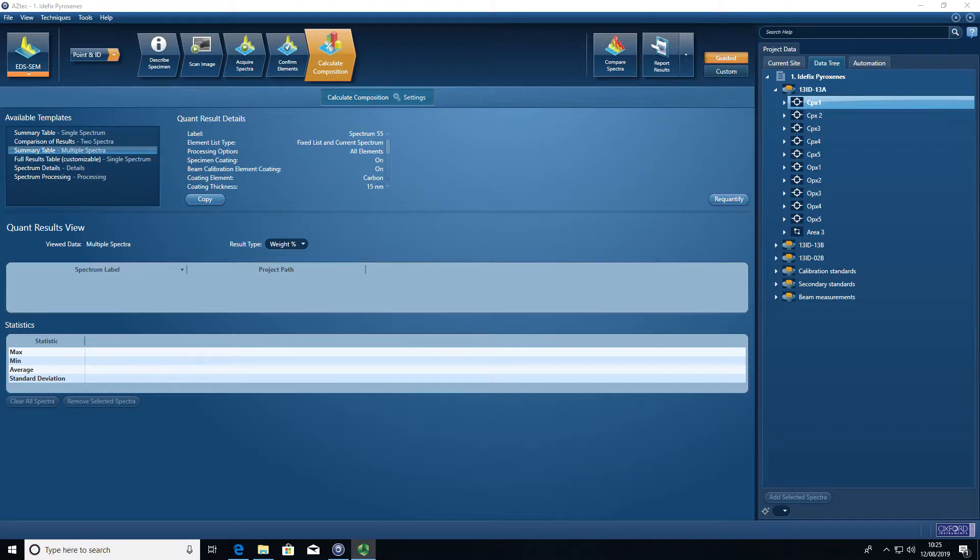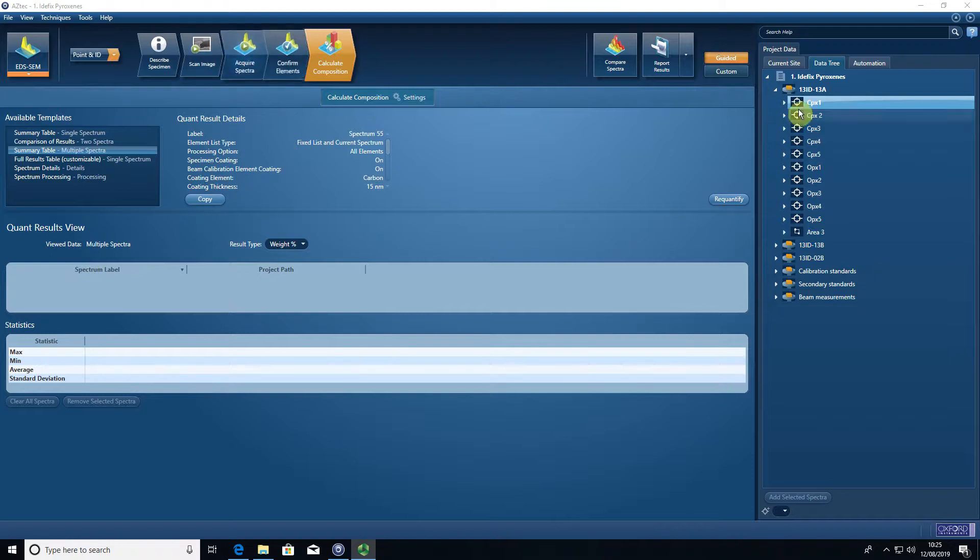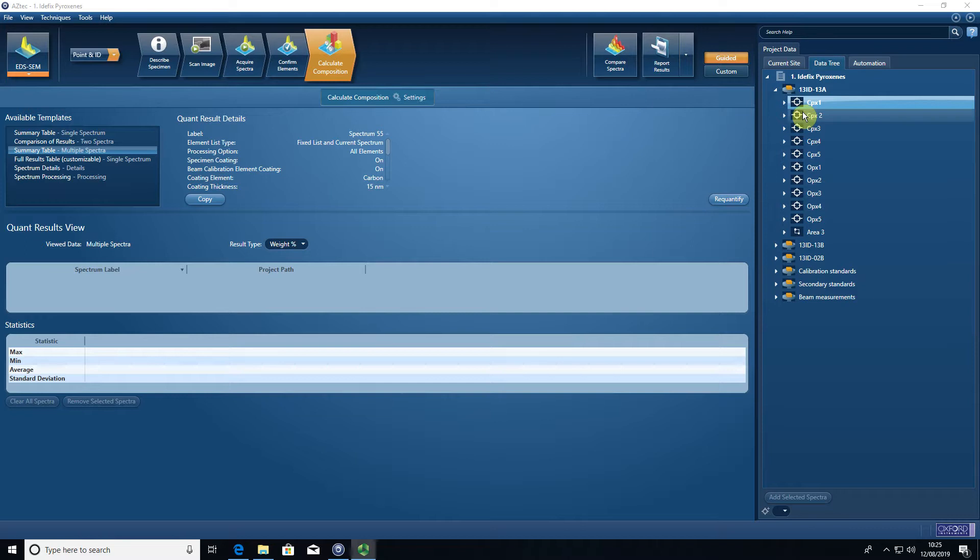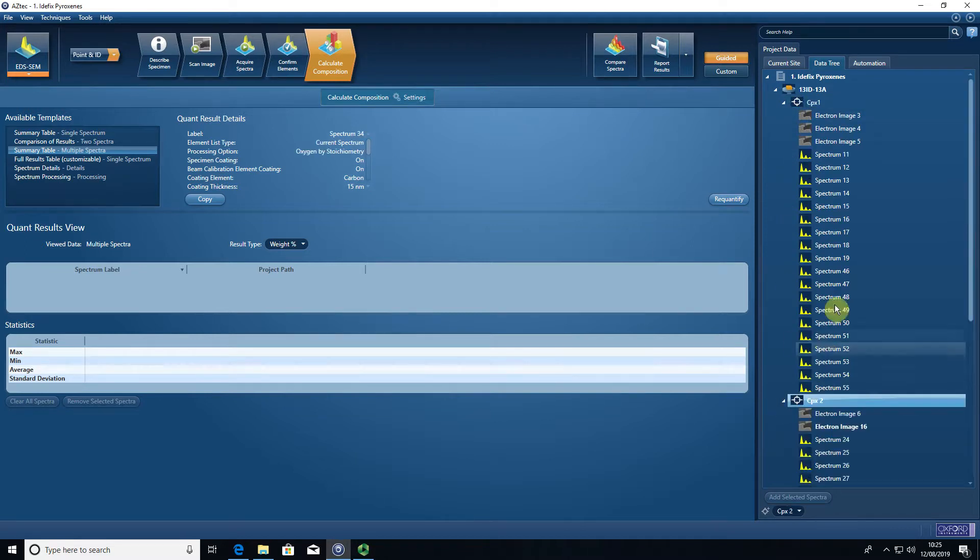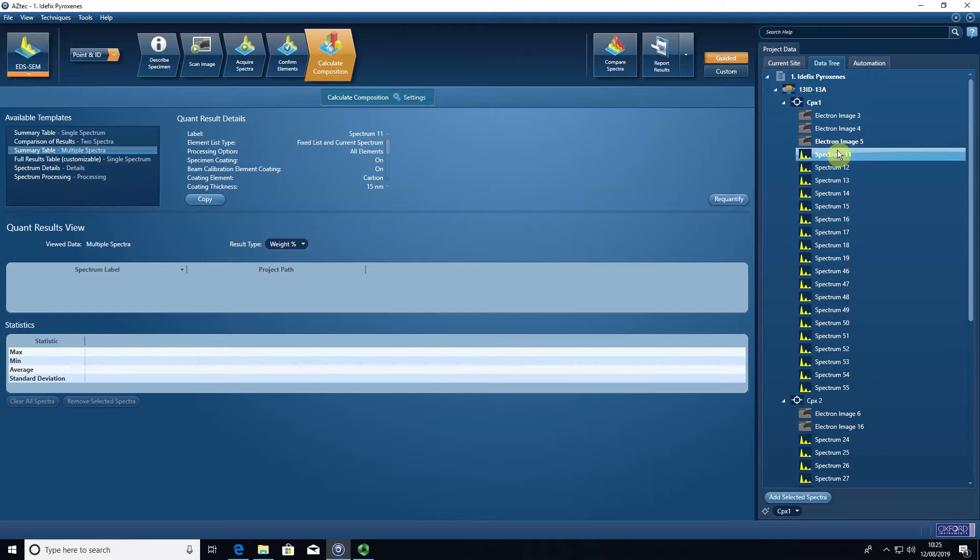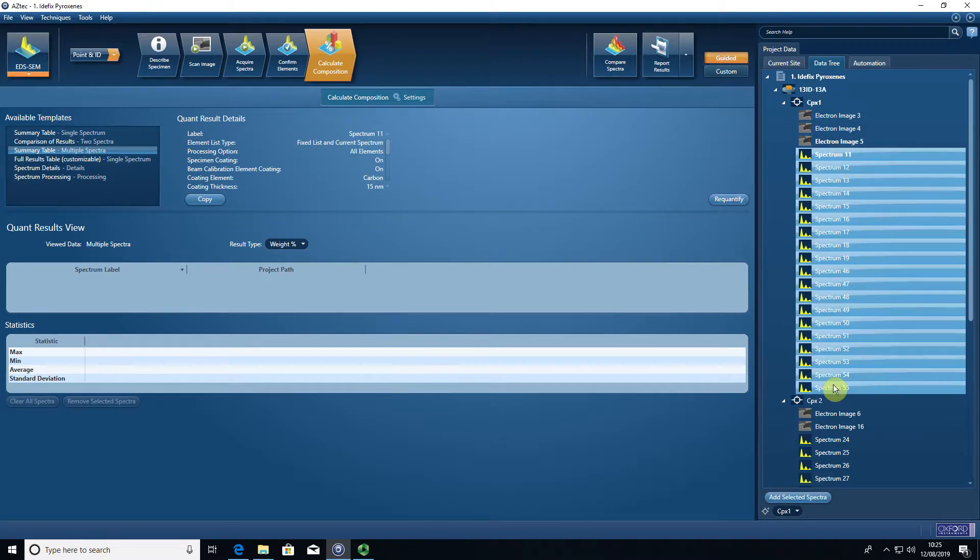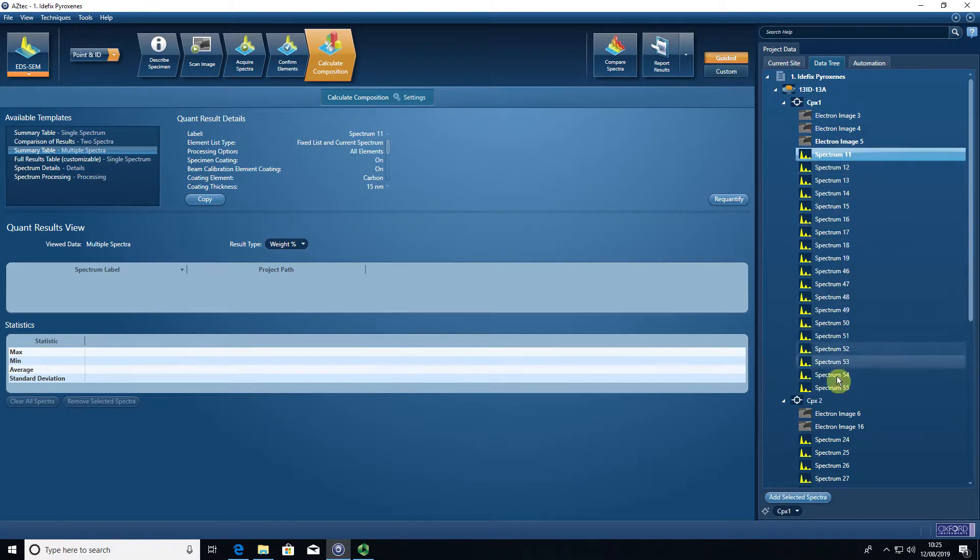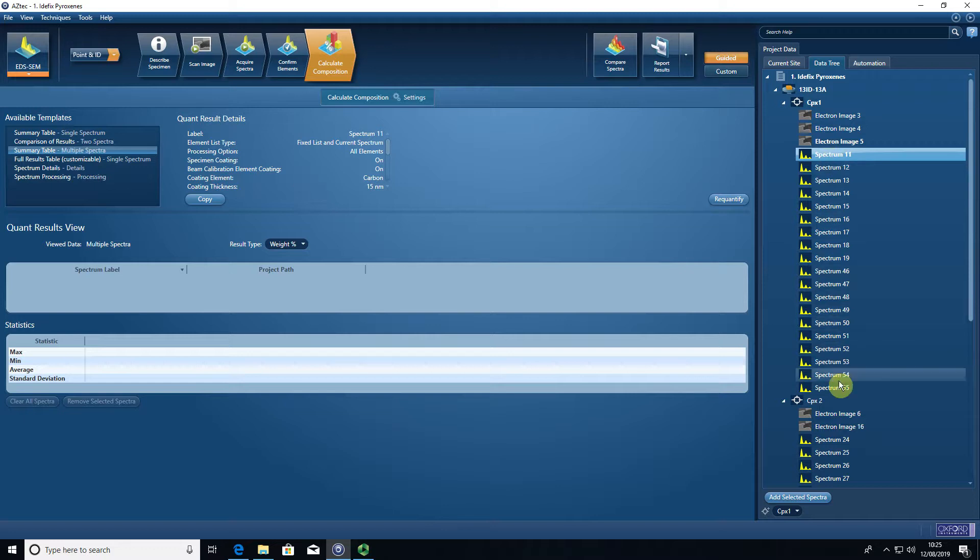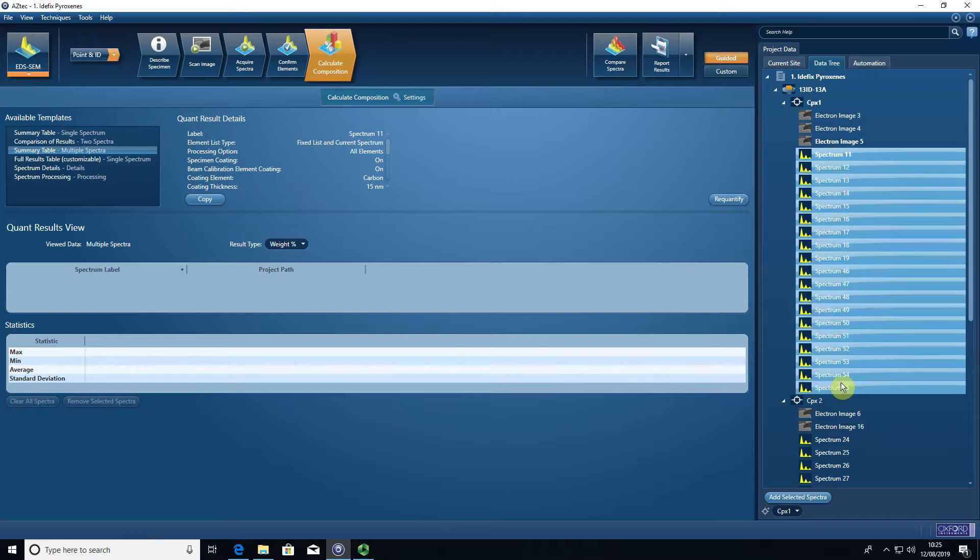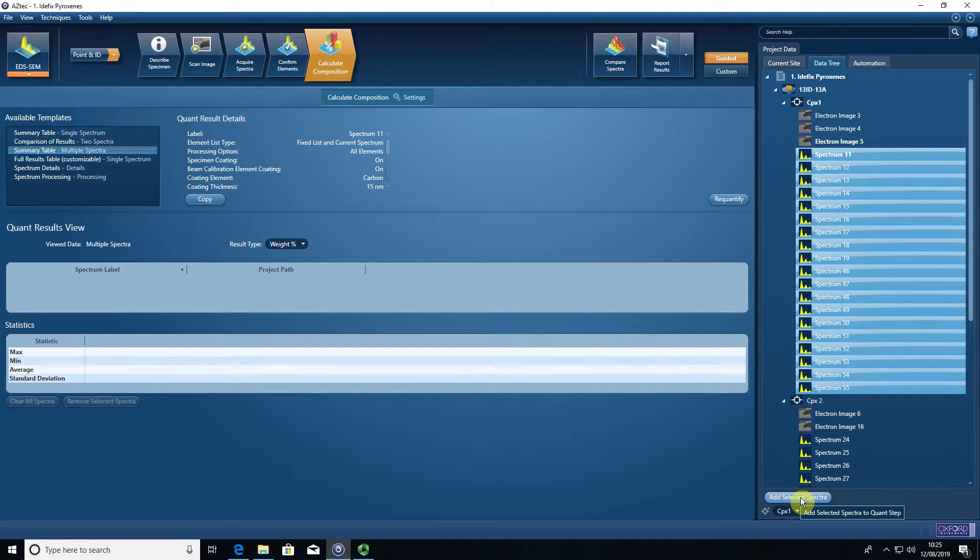You can see here I have a session where if I come to the project data to the data tree, I have a bunch of different analyses of clinopyroxenes. I'm going to show you for one of these sites how I would export the data. I select the spectra I want to view in the calculate composition part of the software. I'm in the summary table for multiple spectra. If I click on the top one, press shift, click on the bottom, I select all and I add selected spectra.